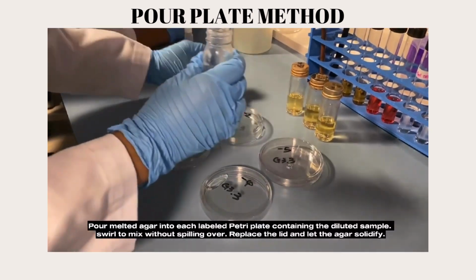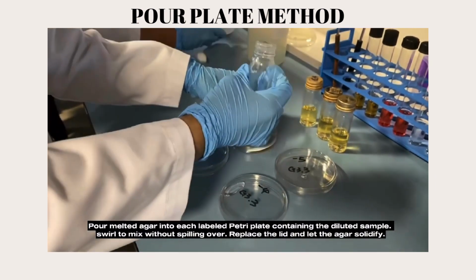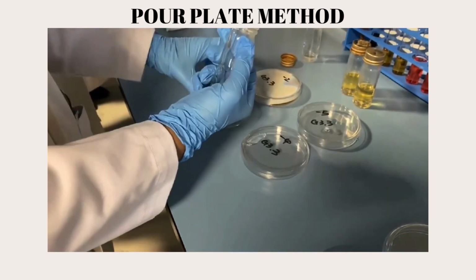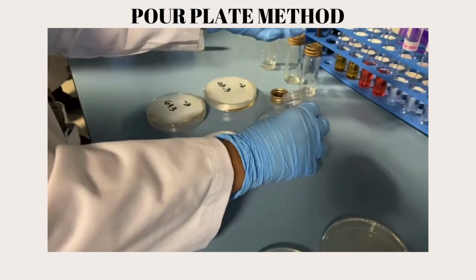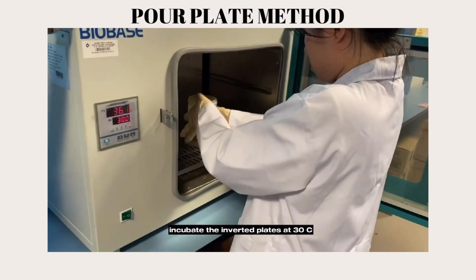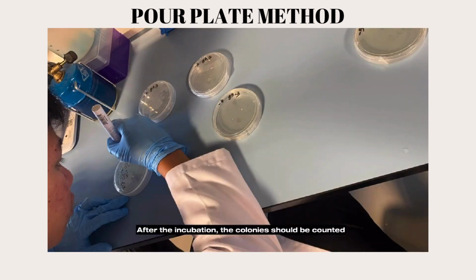Pour melted agar into each labeled petri plate containing the diluted sample. Swirl to mix without spilling over. Replace the lid and let the agar solidify. Incubate the inverted plates at 30 degrees Celsius. After the incubation, the colonies should be counted.